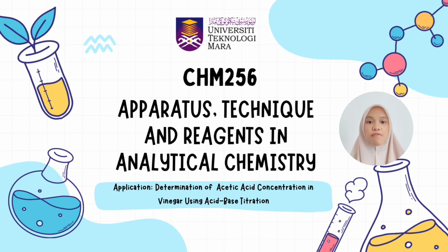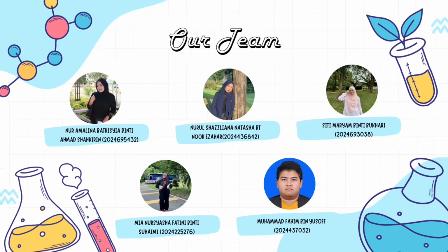Our application focuses on the determination of acetic acid concentration in vinegar using acid-base titration. Through this presentation, we will discuss the laboratory apparatus, analytical technique and reagent involved in this analysis.